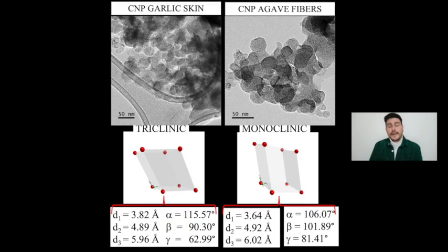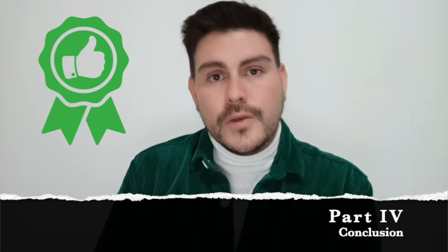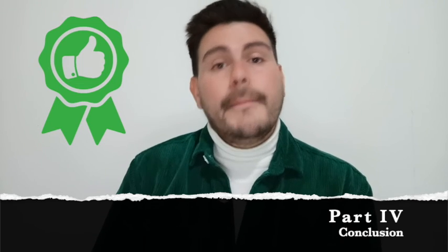Finally, we can obtain from the simulation that the distances are very similar between them, but the angles are the main part in the simulation and are characteristic of the triclinic or the monoclinic structure. We found that cellulose from agave is more monoclinic and cellulose from garlic is more triclinic. With this important investigation, we can achieve the same results as with spectroscopic techniques, but using only one image from a bunch of images that we can obtain in the TEM microscope.